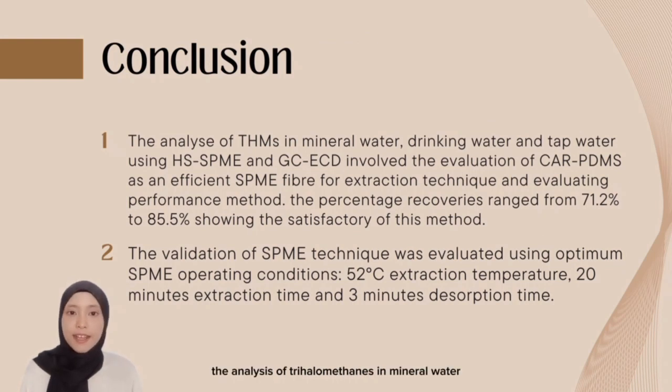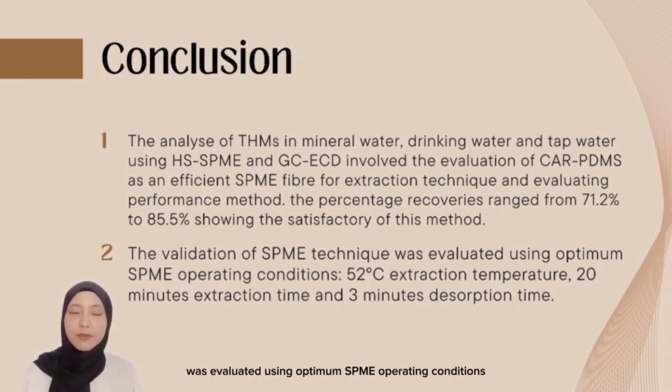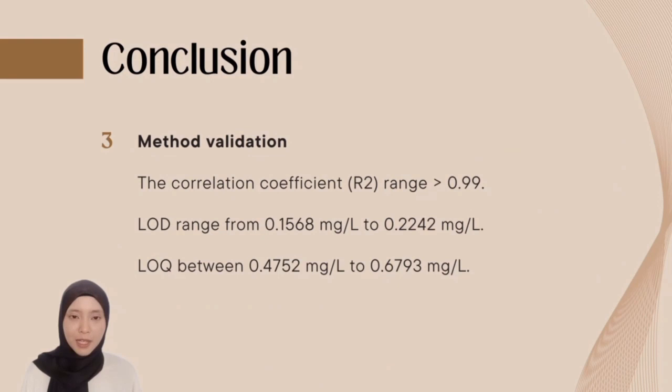In conclusion, the analysis of trihalomethanes in mineral water, drinking water, and tap water using headspace SPME and GC-ECD involved the evaluation of CAR-PDMS as an efficient SPME fiber for the extraction technique and evaluating the performance of the method. The percentage recoveries range from 71.2% to 85.5%, showing the satisfactory performance of this method. The validation of the SPME technique was evaluated using optimum SPME operating conditions with 52 degrees Celsius extraction temperature, 20 minutes of extraction time, and 3 minutes of desorption time.